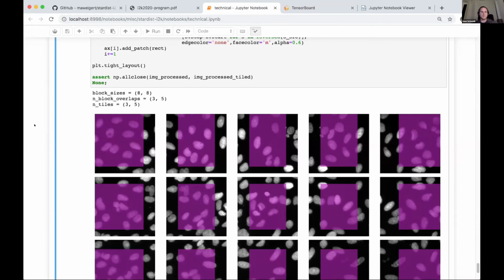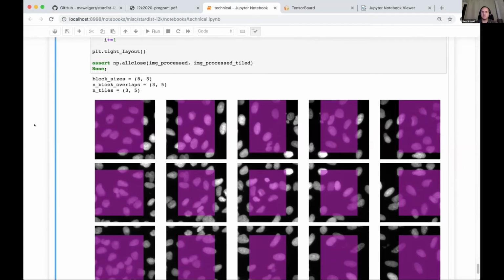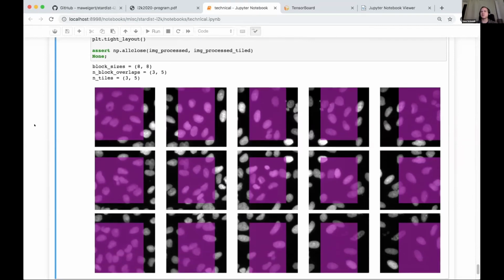Okay. There are functions in StarDist and CSBDeep in the Keras networks that tell you how big the block sizes should be. But this is neural network dependent, so it's not easy to give an answer that works in general. You can always determine it empirically by just running a computation. Okay, thanks. And that's what we do in StarDist, because it's not as easy anymore.